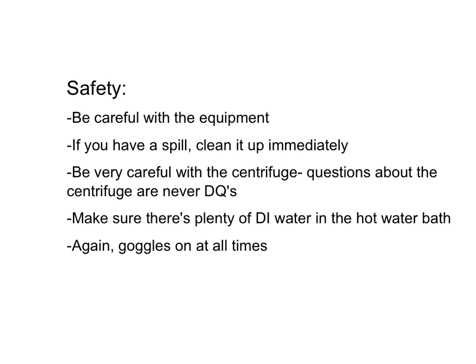You'll also have some hot water baths that you'll be dropping some solutions in and out of. Please always make sure that there's plenty of water in them. If you see any of the DI hot water baths starting to get low, let us know, and we will very quickly refill them so that it's not an issue. If they get too low, it could cause the beakers to shatter, and that's not good.